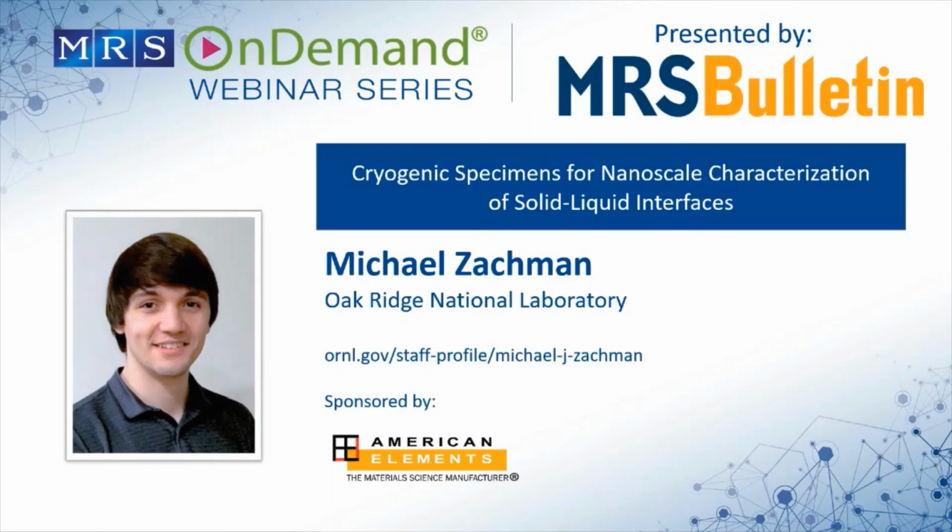Yeah, so at the Center for Integrated Nanotechnologies, you can find the capability at cint.lanl.gov. We have a cryofib that is operational and a cryo-TEM and transfer equipment. There is also one at Cornell, obviously, since that's where I was. I talk to people at conferences, and I know who's planning to get them, but I don't know what stage they're at. So I'm glad you can speak to where there actually are some at this point.